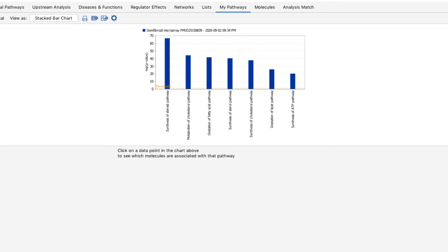The purpose of the MyPathways results is to show which customized pathways or networks are significantly enriched in your analyzed dataset.